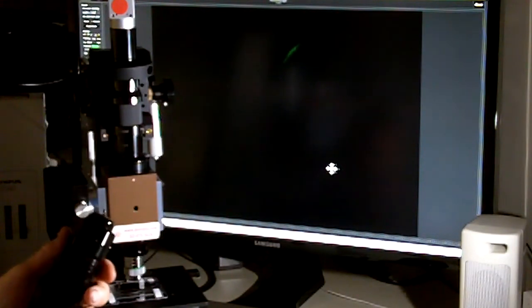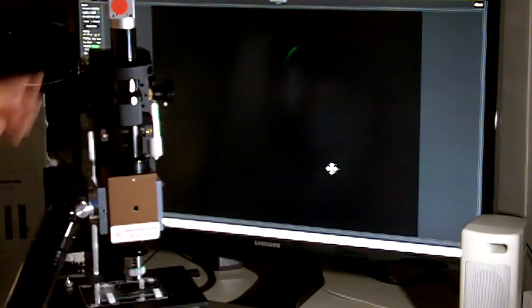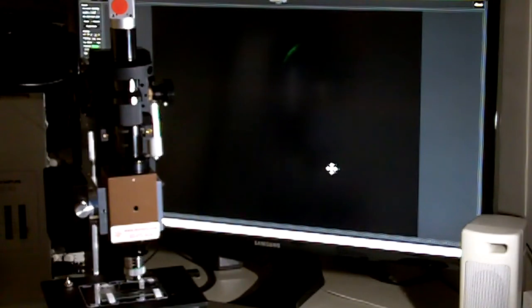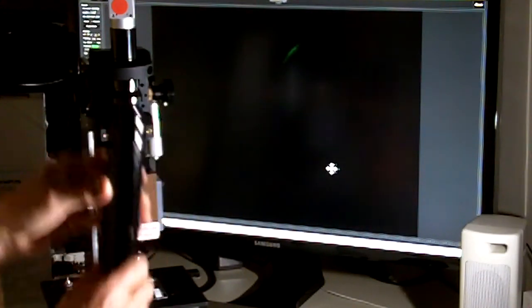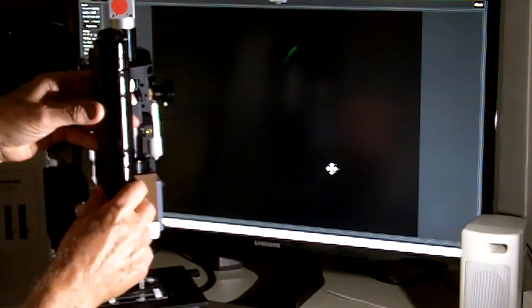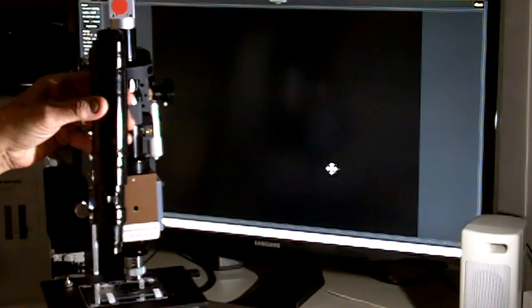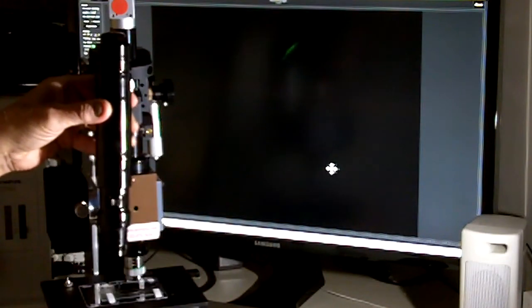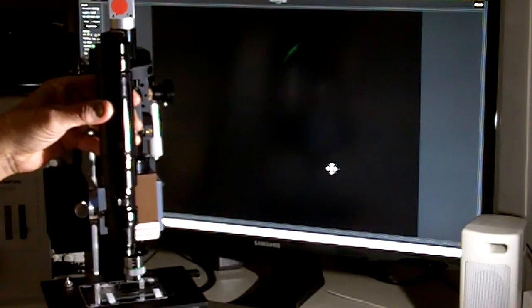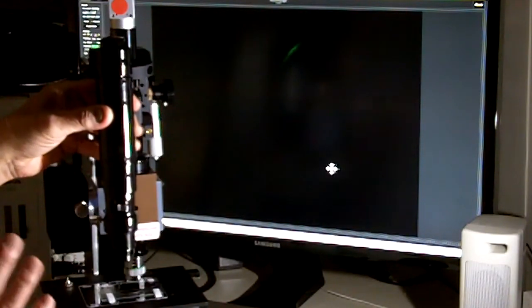If you need color, then that color camera is available. And that's what I've got set up now. So this is the basic microscope. It clamps onto the front here. It's about 11 inches long. It doesn't take up much space. Great working distance.